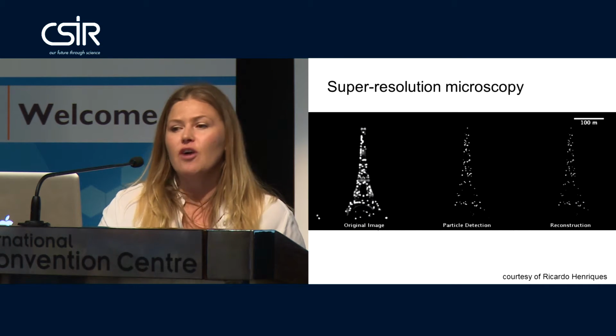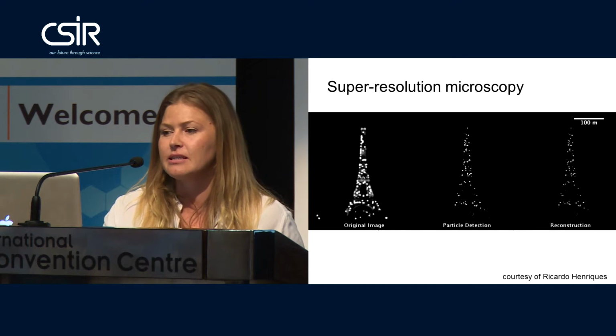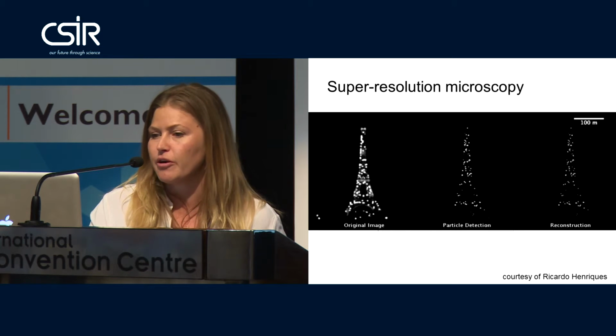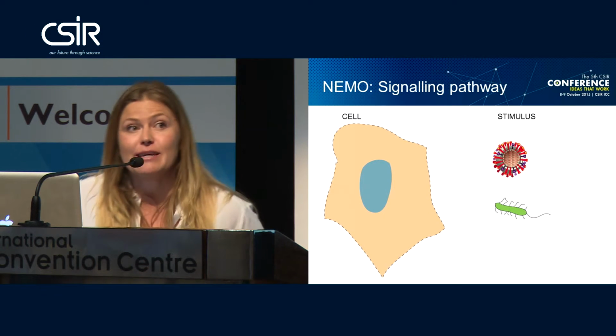So what I hope you can garner from this is that though we see some detail here when we're actually looking at it, you get much more exquisite resolution post-reconstruction. And that's basically how super resolution microscopy works in the example that we do. So let's get back to NEMO.